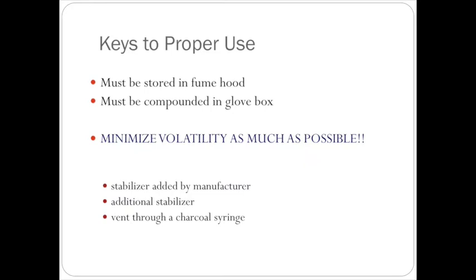It's going to go through some filters to try to trap the iodine, the actual radioactive component of the iodine, so that we're releasing things into the outside environment that are no longer radioactive. When we actually manipulate it, and as I said, we have liquids, sometimes we have capsules. We also can make our own capsules, which we take liquid and just put it into capsule form.